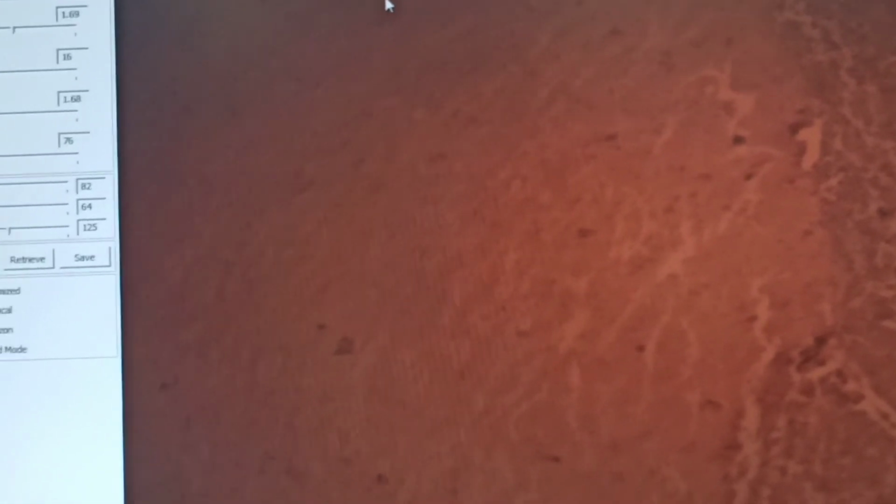Whatever you see, it is neural cells. Actually, we mostly have axons here. Do you know why? Because all these cords actually are axons, and if we see any nucleus here, it is called a pituicyte. So each single nucleus here, you can see the dense nucleus here.